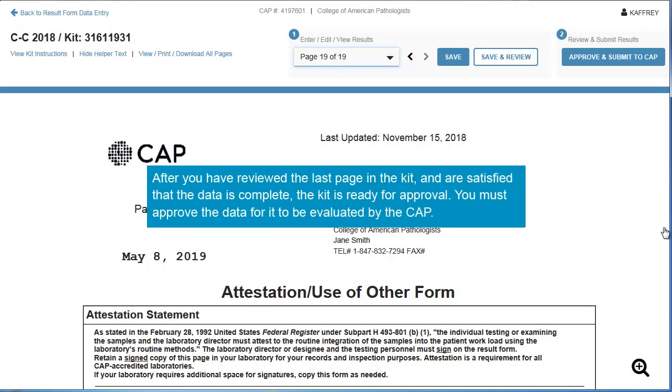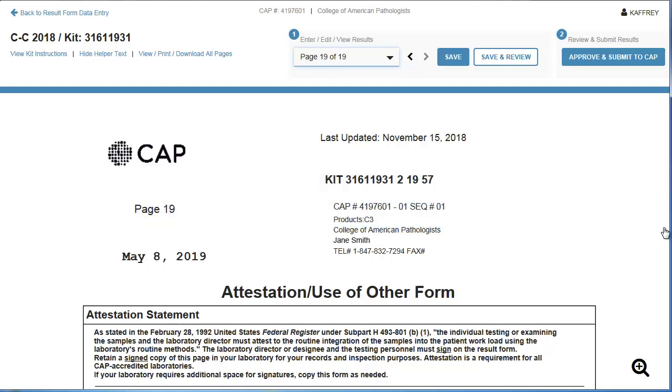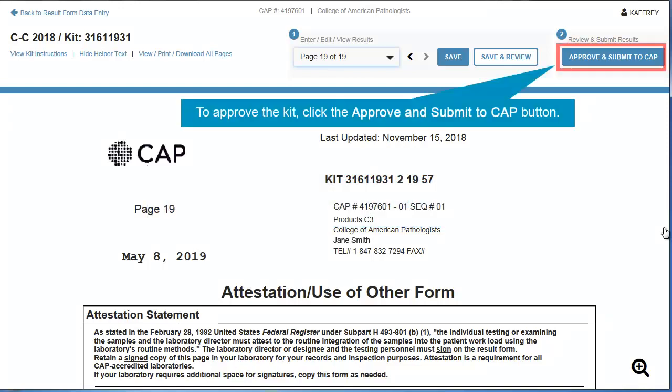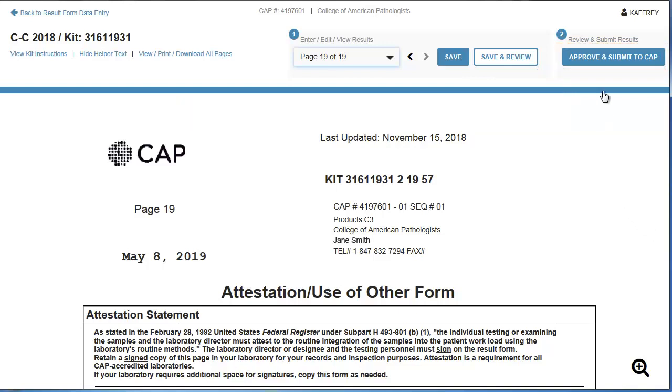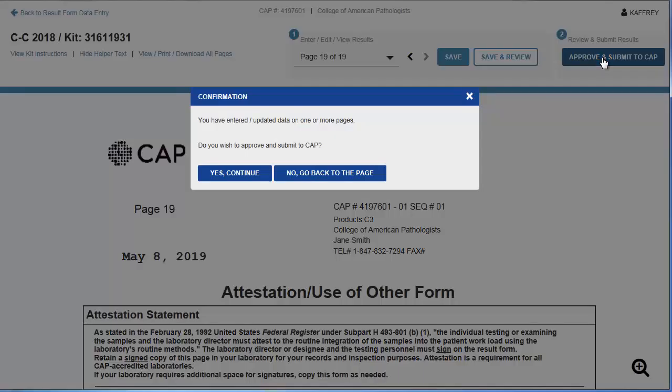After you have reviewed the last page in the kit and are satisfied that the data is complete, the kit is ready for approval. You must approve the data for it to be evaluated by the CAP. To approve the kit, click the Approve and Submit to CAP button. Click Yes to confirm.